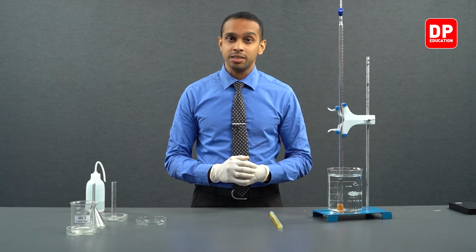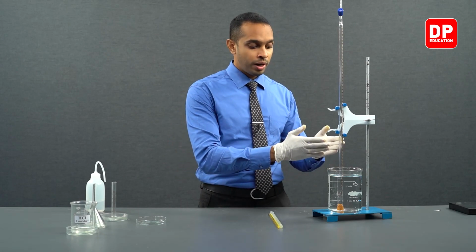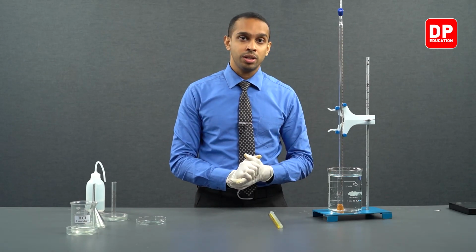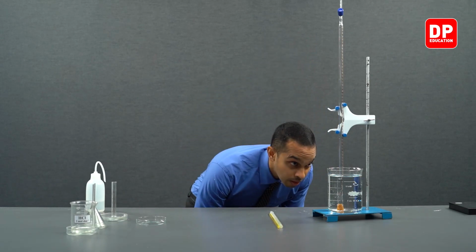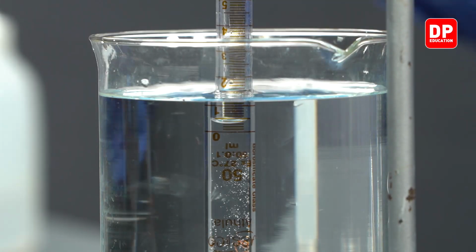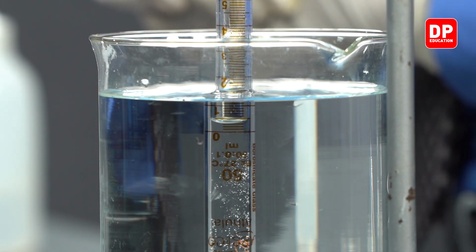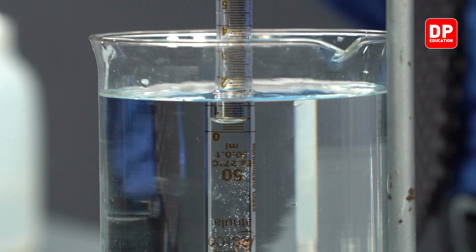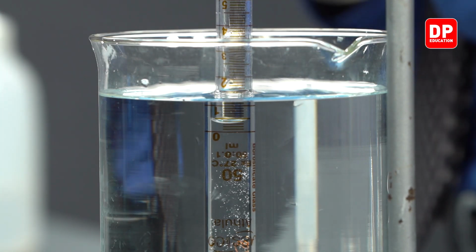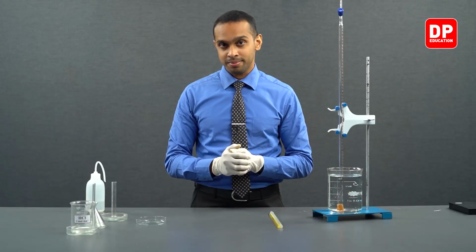Like in the first trial that we did, we can take the reading when the burette is submerged underwater like this. We can see the burette reading is at 0.3 cubic centimeters, meaning the amount of gas that is collected is 49.7.